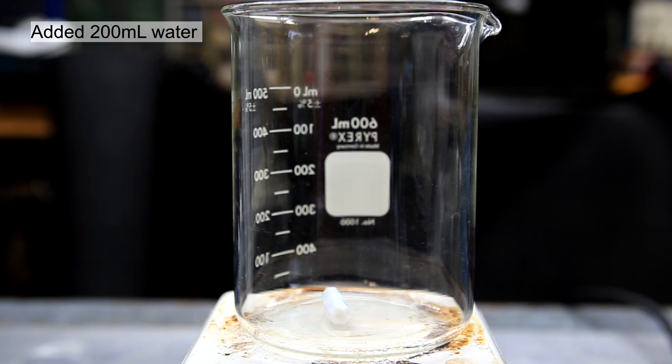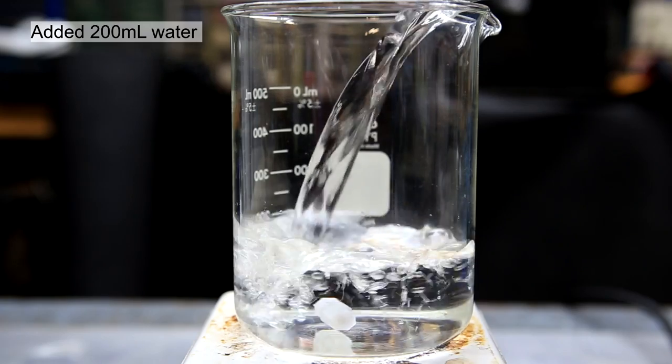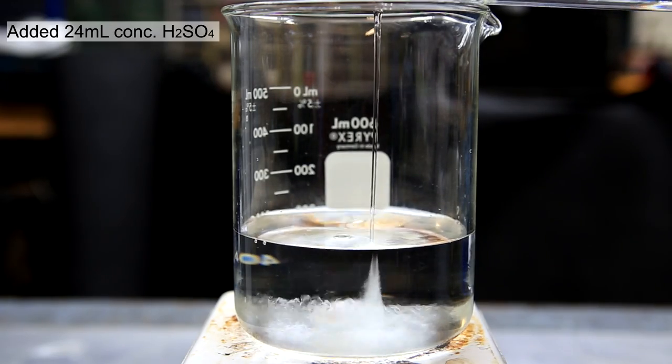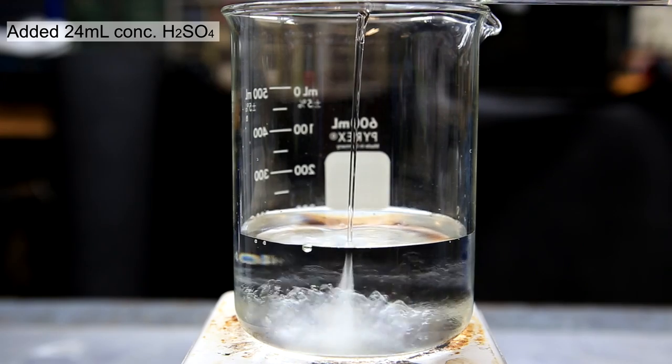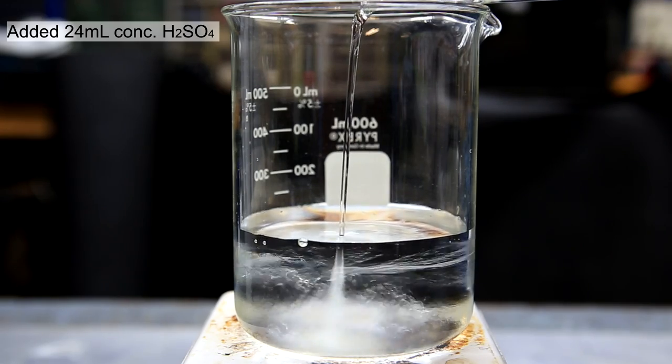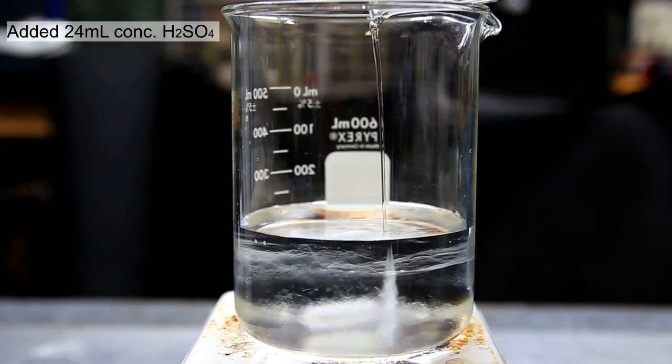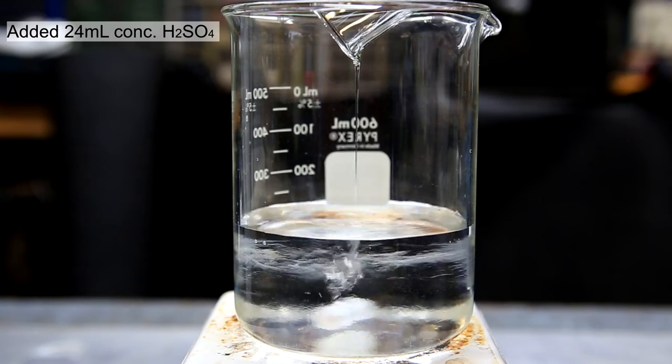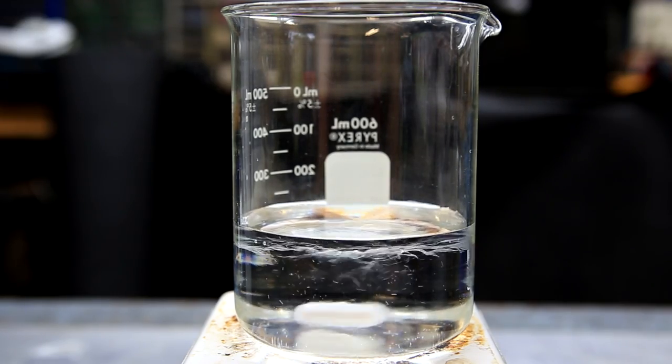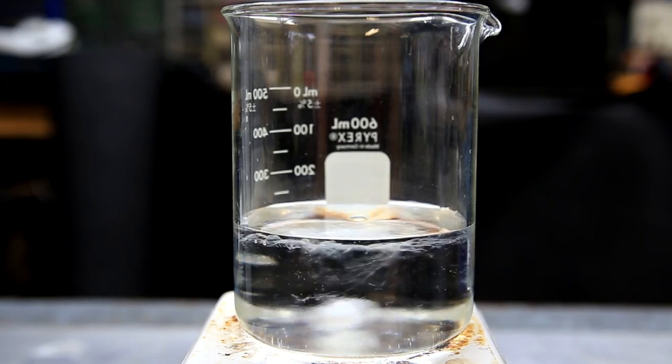To start off, 200 milliliters of distilled water was added to a beaker. Then with rapid stirring was added 24 milliliters of concentrated sulfuric acid. And now for the typical warning: be sure to add acid to water and not the other way around because it can get a little messy and dangerous. Keep stirring it thoroughly until the sulfuric acid is fully mixed into one homogenous solution.